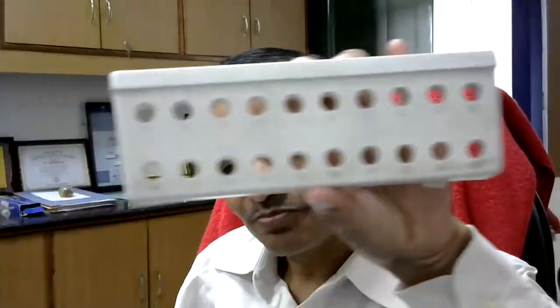Okay, so while working with these tubes, you have to keep them somewhere. So this is called rack, Eppendorf tube rack. So that you can keep things like this. You can keep it here in this rack. So many tubes can be kept here, and you can work. The two lanes are there, so you can keep and work easily. There are different sorts of these racks, different types of rack.